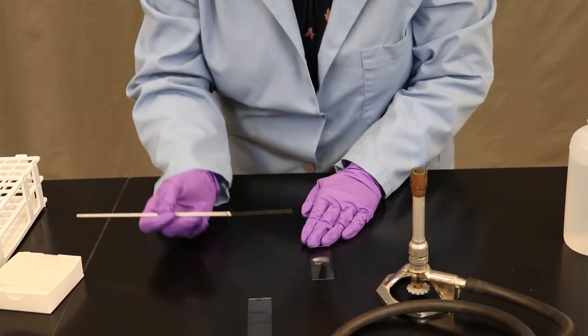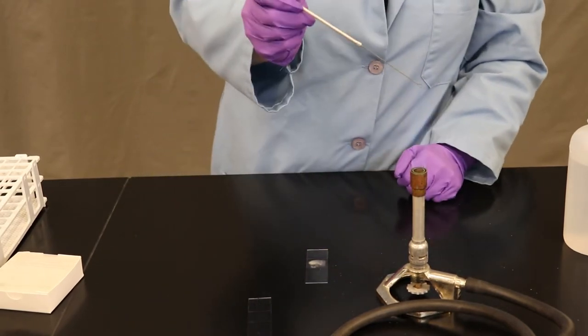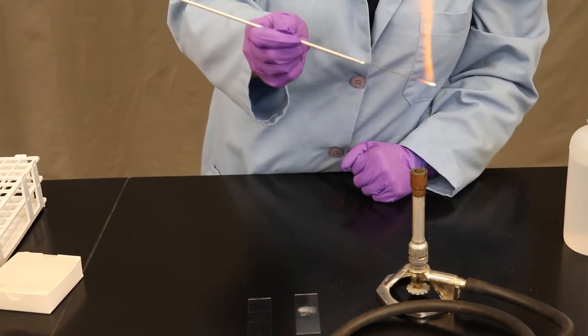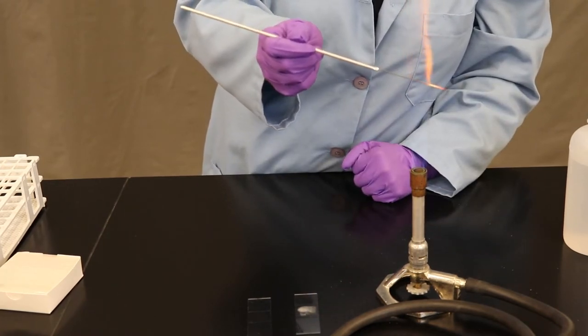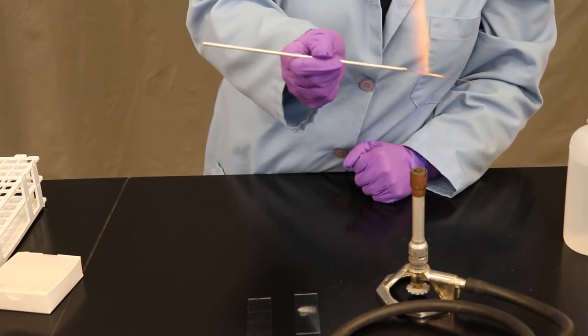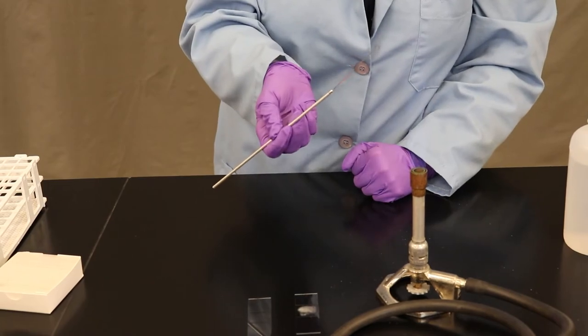Last but not least, make sure to sterilize your metal loop one last time before putting it down. Now we wait while our smears dry. Once they are completely air-dried, we'll move on to the next step.